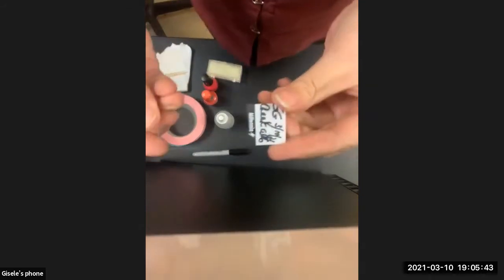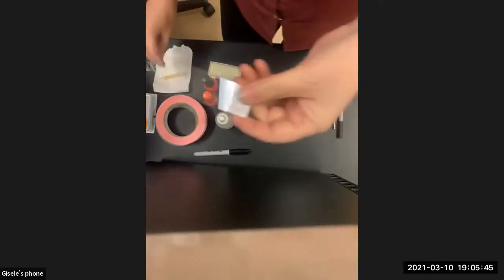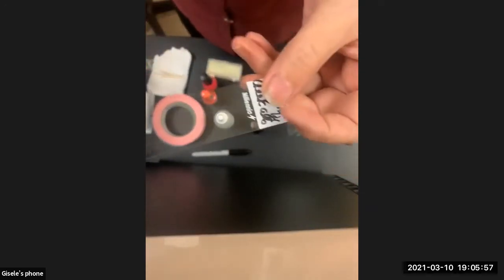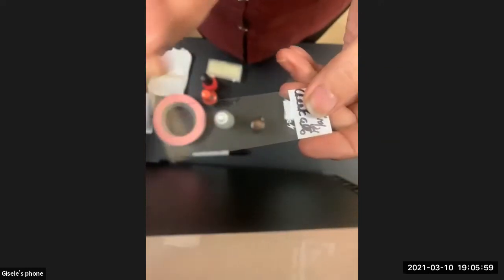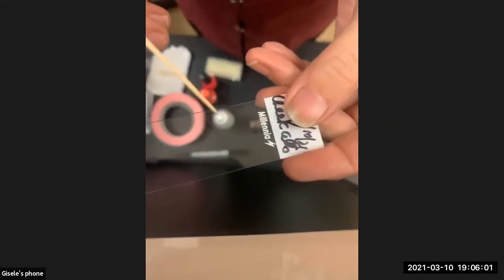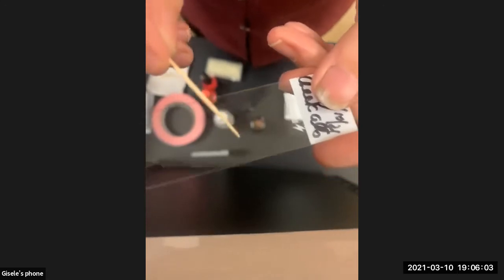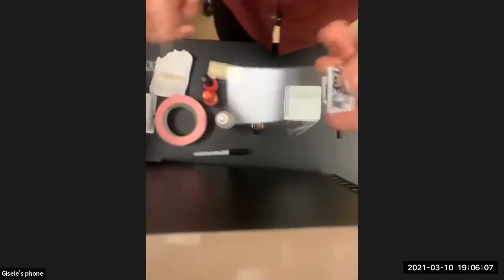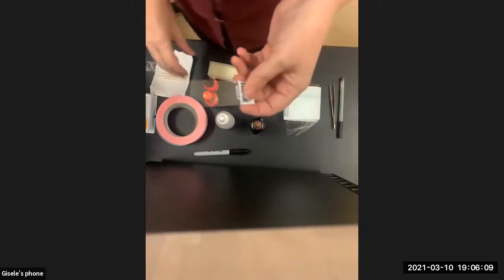Okay, so I've got this nice clean slide. It's labeled. And then I'm not going to show you this part, but you're going to do cheek cells. You just take a toothpick and gently scrape the inside of your cheek. The science should not hurt, okay? So super gently. And then you're going to have a little tiny glob of spit that maybe you can see, maybe not. Sometimes you just have to believe it's there. And there's going to be cheek cells, and you're going to dab it on your slide. And it may just look as invisible as that.